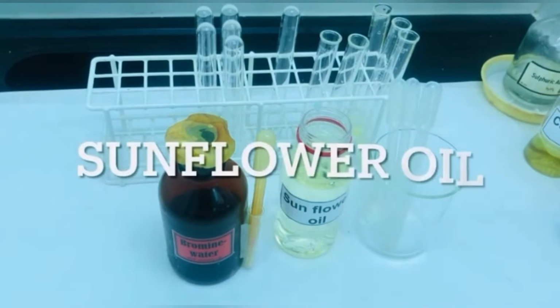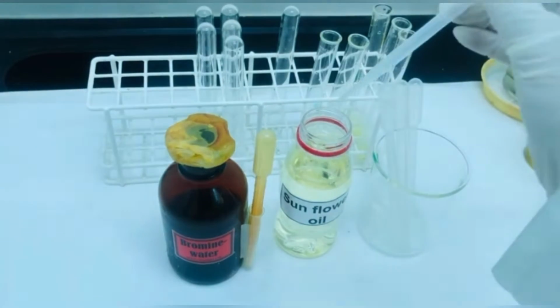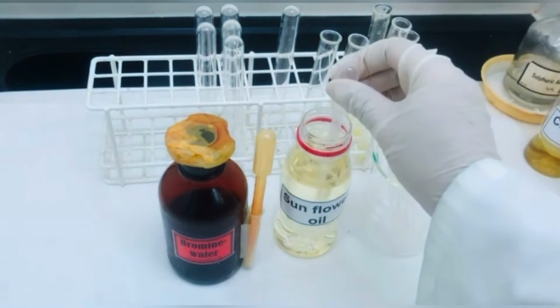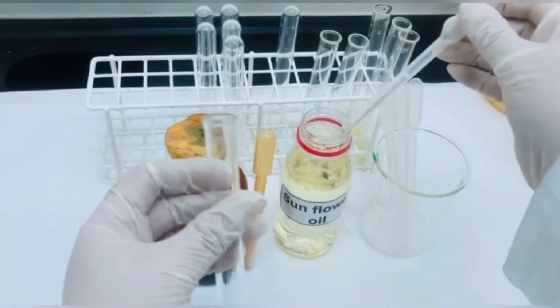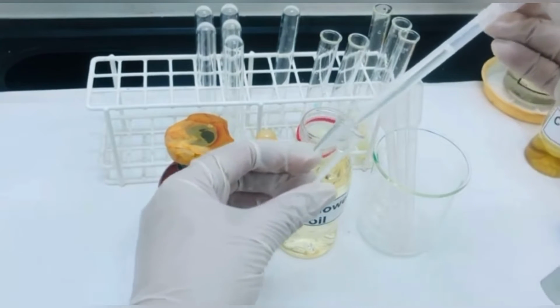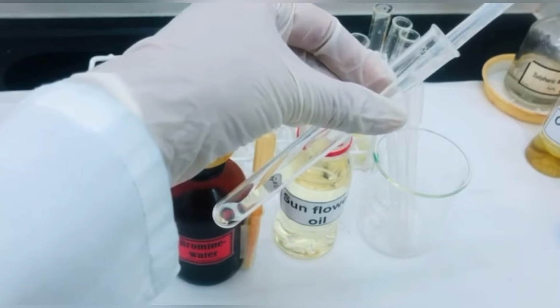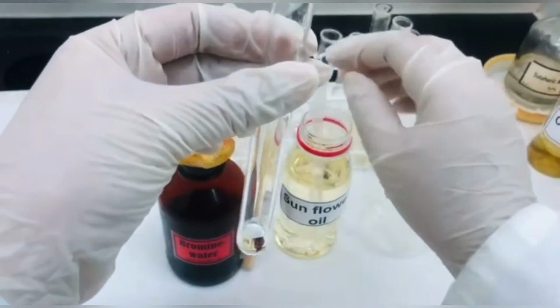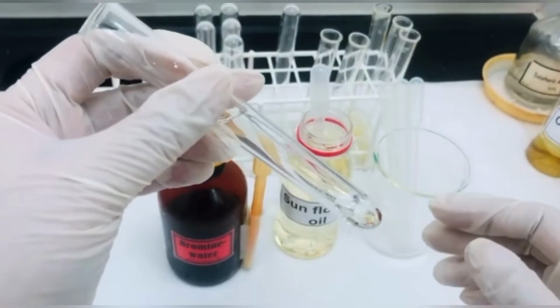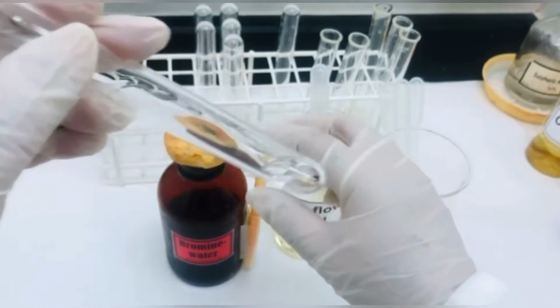One of the samples that we are using is that of sunflower oil. So we will take 1 ml of the sunflower oil and pour it in the test tube. To this sunflower oil, we are going to add a few drops of bromine water.